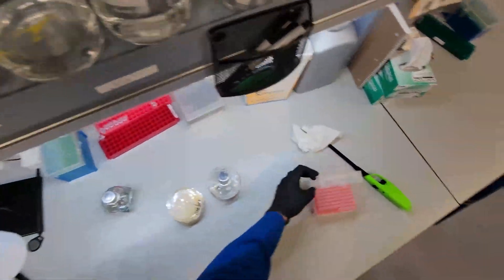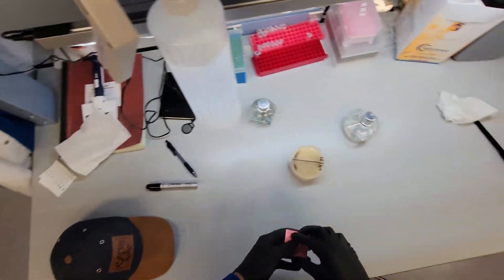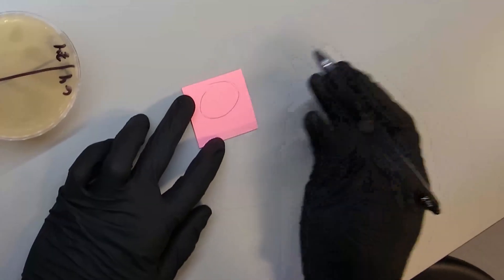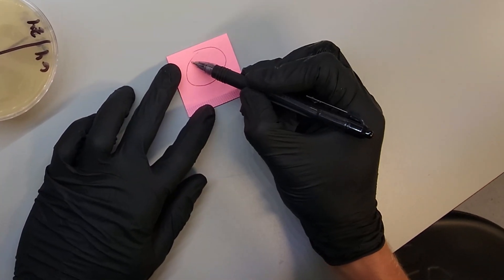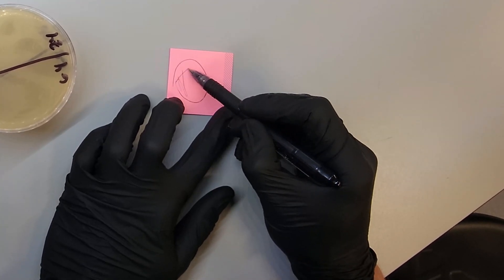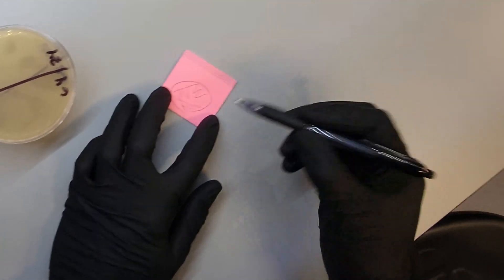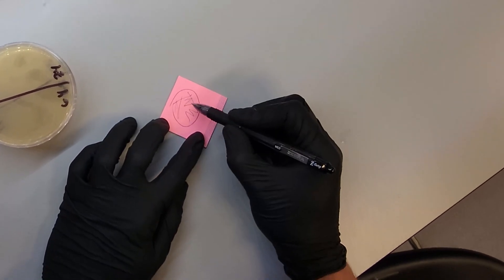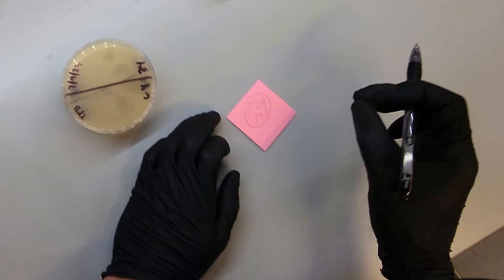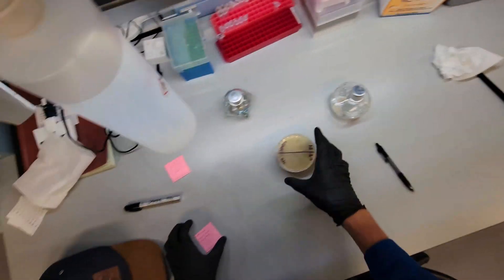These are sort of rough and ready streak plates, and it's not a guarantee that I'm going to get individual colonies the way that I did this, but it should be pretty good. Really, when you're doing streak plates, it should look something like this. You should get a new petri dish, dip into your glycerol stock or whatever, and do a zigzag. Then rotate the plate, get a new tip or wooden toothpick, pull from wherever you streaked before, do a zigzag. Throw that tip away and get a new one. You can do this three or four times — each time you streak, you're diluting the cells. But I've used these glycerol stocks a lot, and I'm pretty sure that just that one streak will get us to single colonies. These single streaks should be enough.